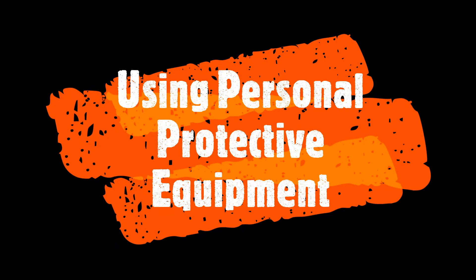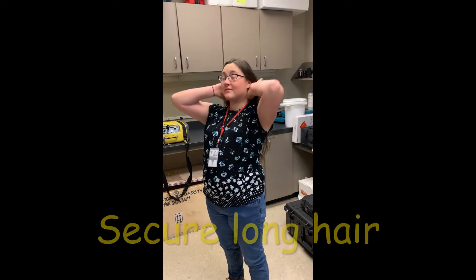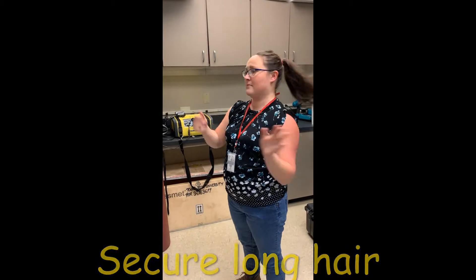Using personal protective equipment. First, let's don PPE. Always secure long hair and loose clothing out of the way to ensure they don't interfere with experiments.